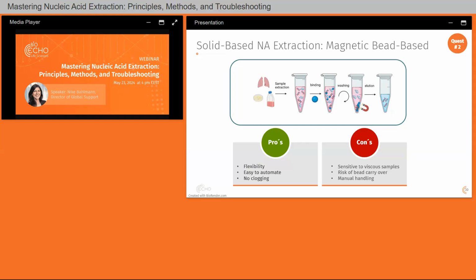There's obviously also direct lysis, which some of you mentioned before. This means we lyse our sample and take directly from this sample a small volume and can go to our PCR, which is also a method that works very well and very fast, but sometimes it comes with a fallout rate. Why we are here today and why we are talking about this.